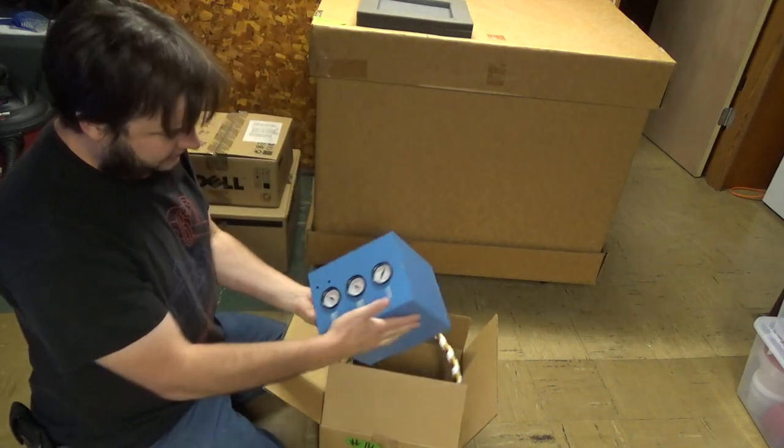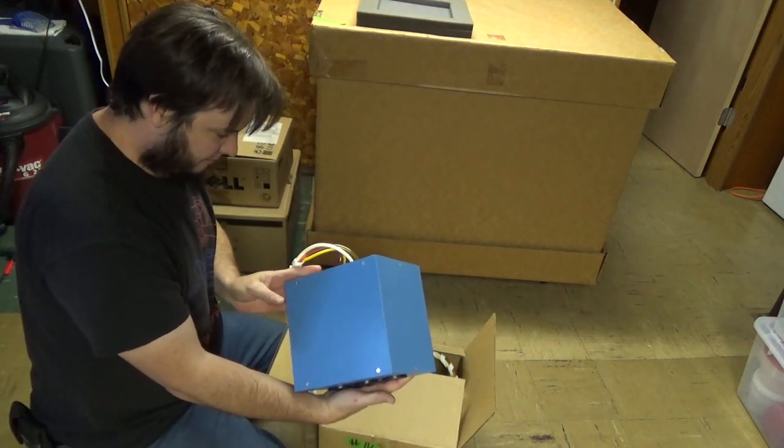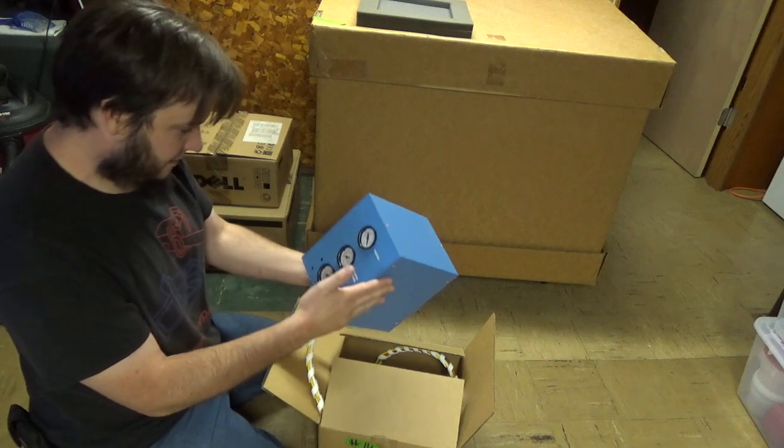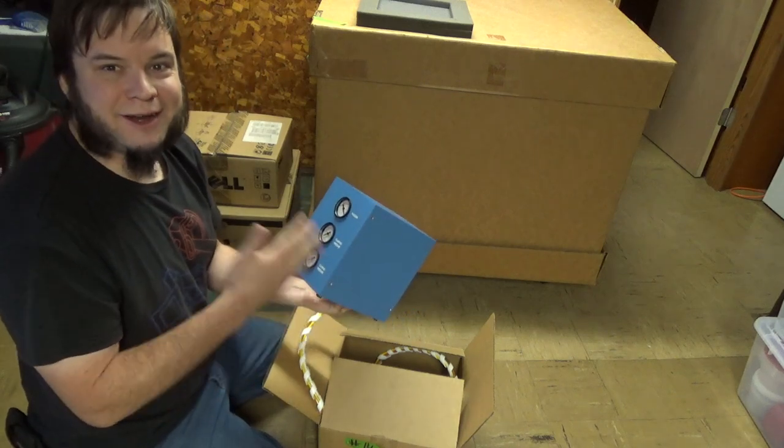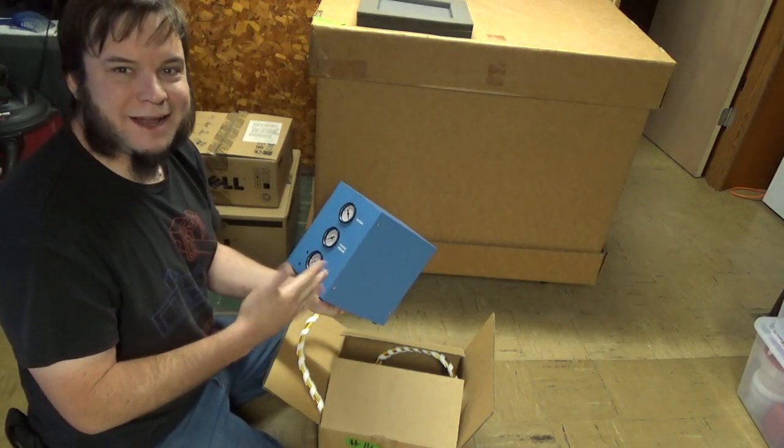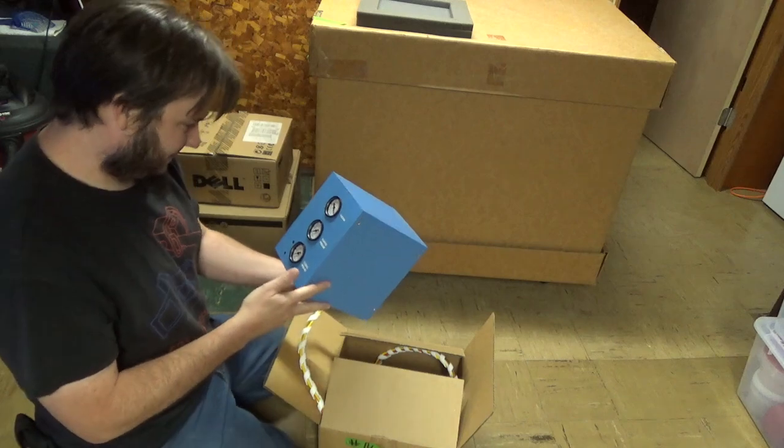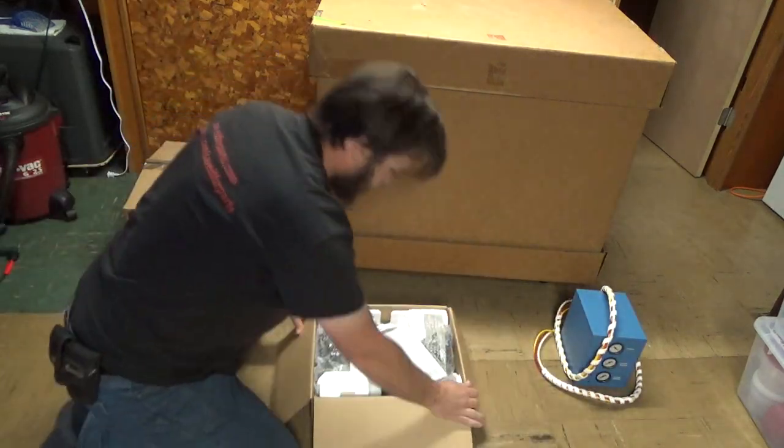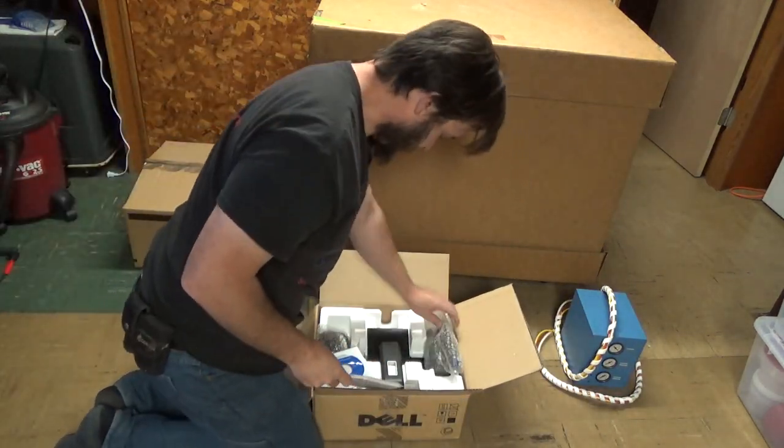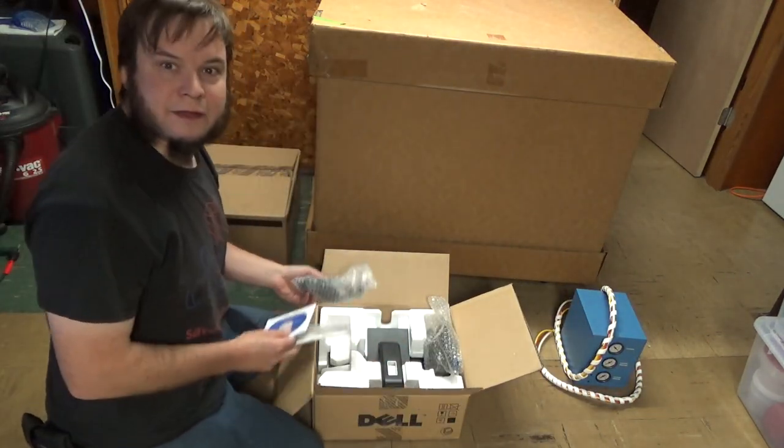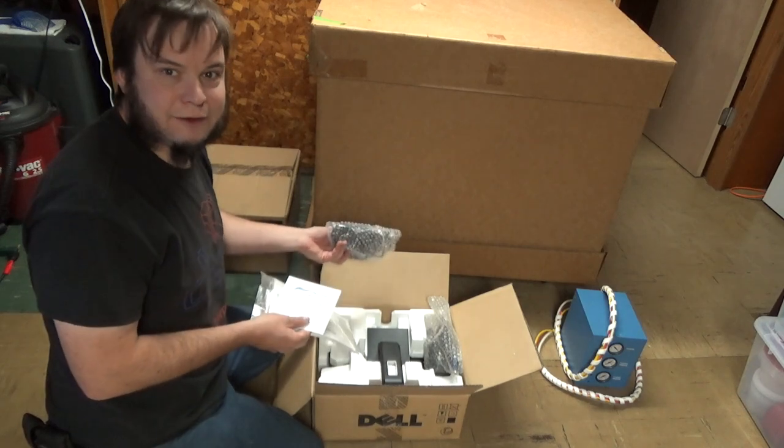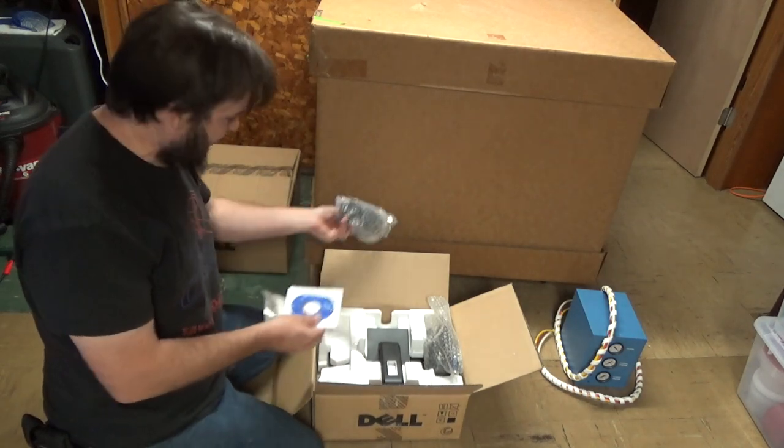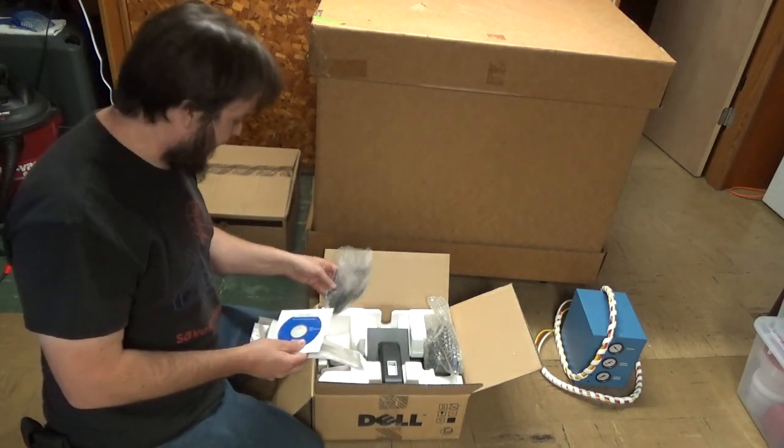Alright, we've got a vacuum thingy. Some loose parts in there. Never a good sign, but we'll set that aside and come back to it. This looks like a pretty generic Dell computer monitor, all essentially new in the box.